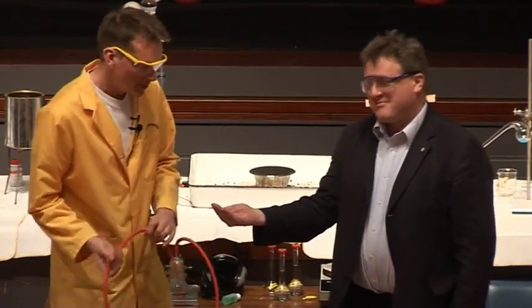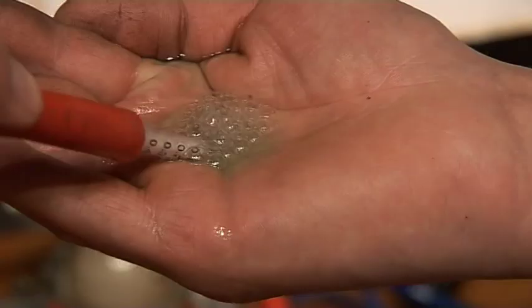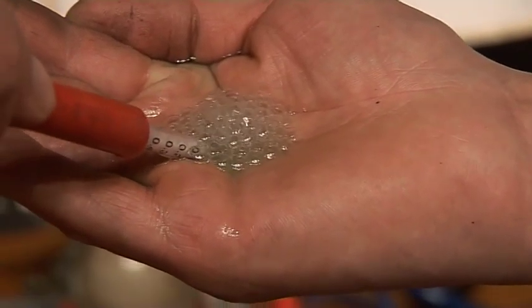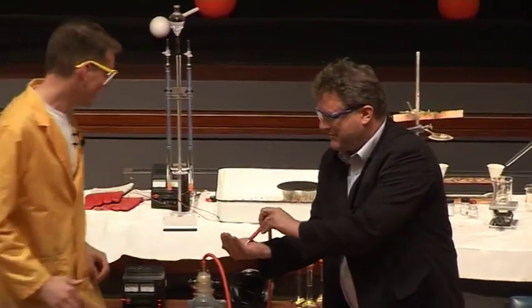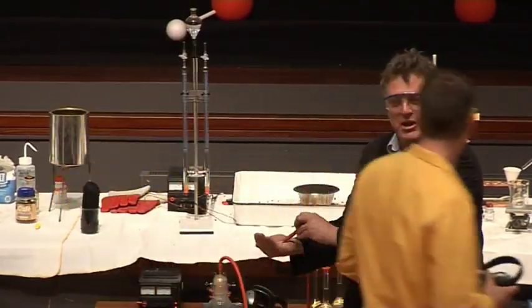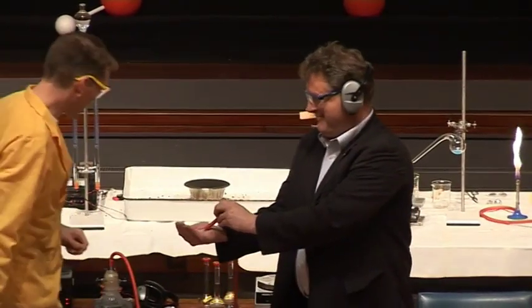Now, over here, we're splitting up some water using an electrical current, just as we did before. And remember, we get the hydrogen and oxygen gas given out in just the right ratios, 2 to 1. And we're combining these gases together, we're mixing them up, and making lots of bubbles on the hand. Perhaps you can just hold that for a second while I stand over here. Okay? No, no, only kidding, no. We're going to put some earmuffs on you, Paul, okay? So you just keep doing that. Yep, okay, we'll have those on there. Okay, all right. Good, now we can say what we like.